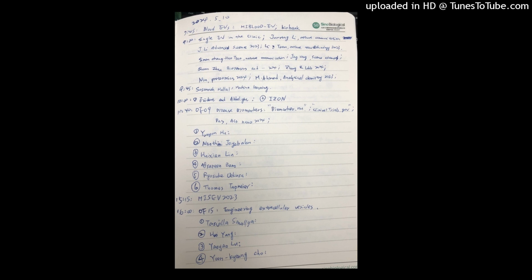Hemolysis is visible. You can just see by eye, and there's even a simple way, you have these strips with color codes. You can semi-quantify the extent of hemolysis. And if the plasma is very fat, you will also see it immediately. So I think you can already do a lot also yourself. Because it's the starting material for your omics, it's very easy to try to measure the platelets.